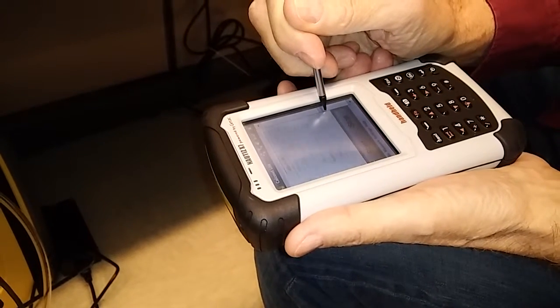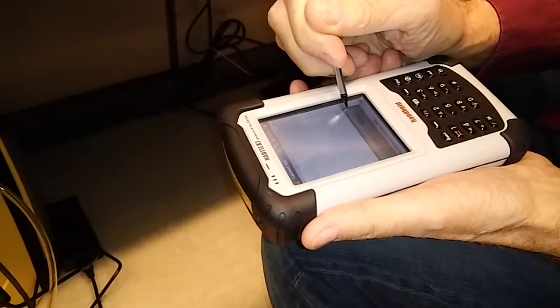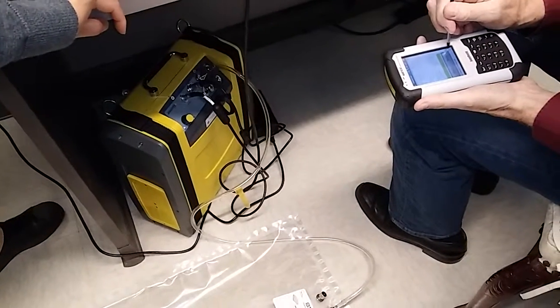Benzene. Everything should be dirt low. So ethanol. Did you analyze this nitrogen gas? Yeah, well that's what we just did. High purity nitrogen gas? Yeah, that's what we did. And it's got the pressure, and it basically got the cell temperature. So these are all the things that it measures.